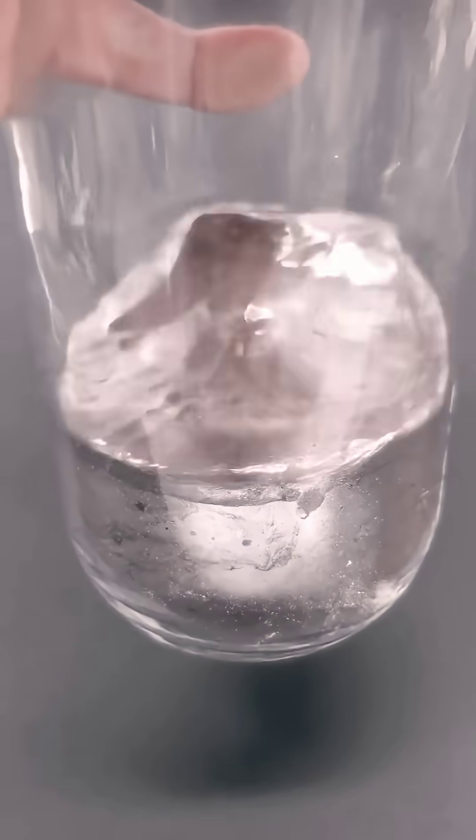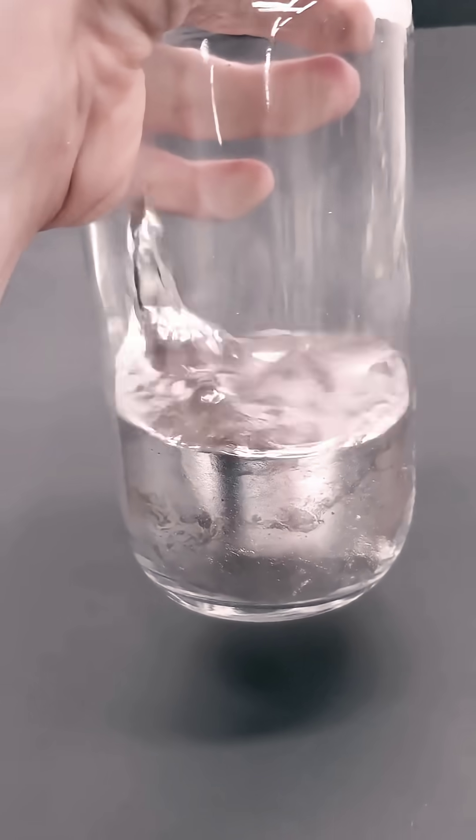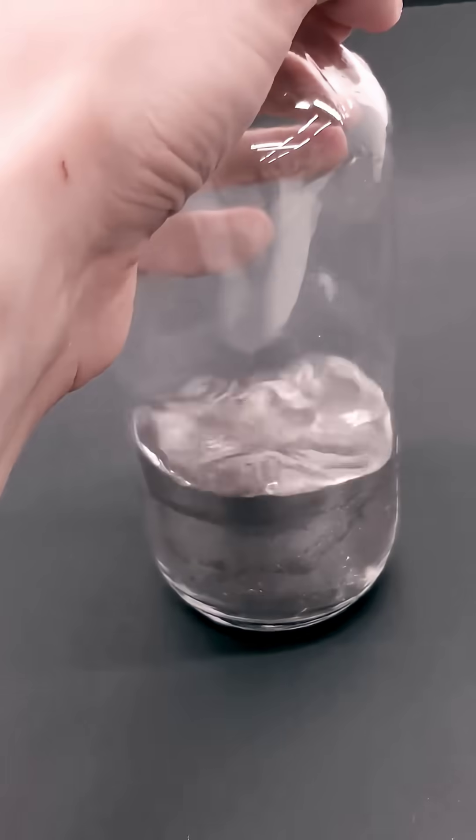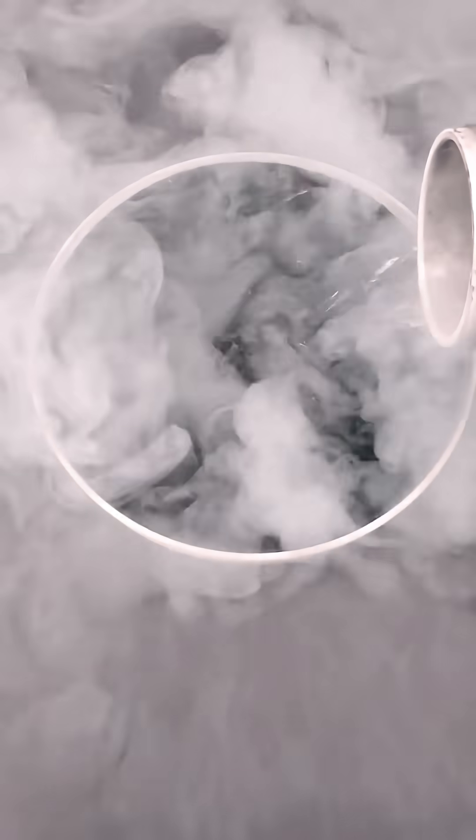Mercury is the only metal that's a liquid at room temperature, and something that I've always wanted to do was to try making it solid. To do this, I just have to add some liquid nitrogen to a dish and wait for it all to cool down.